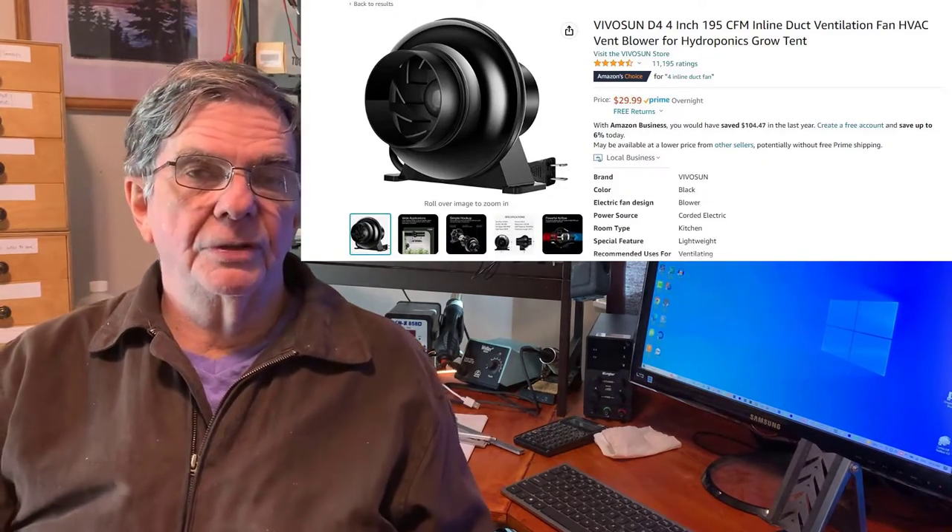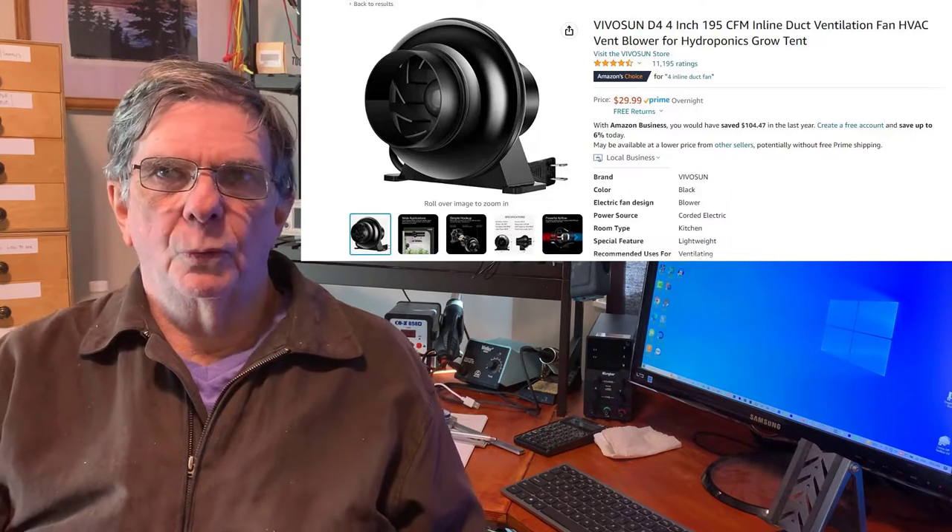I bought a six-inch version, and it's way bigger than I need. I could have bought the four-inch and it would have been fine. So I'll take you to the garage and we'll take a look. It's a very short video, but I consider it a super important piece of equipment.